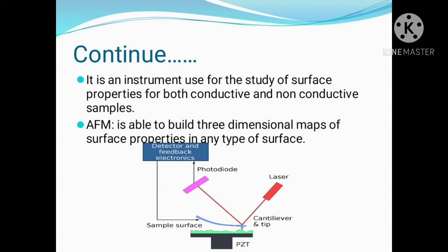Below is the diagram of AFM, which shows the AFM technique, with the probe of the AFM on the sample surface to image the surface properties of the sample.